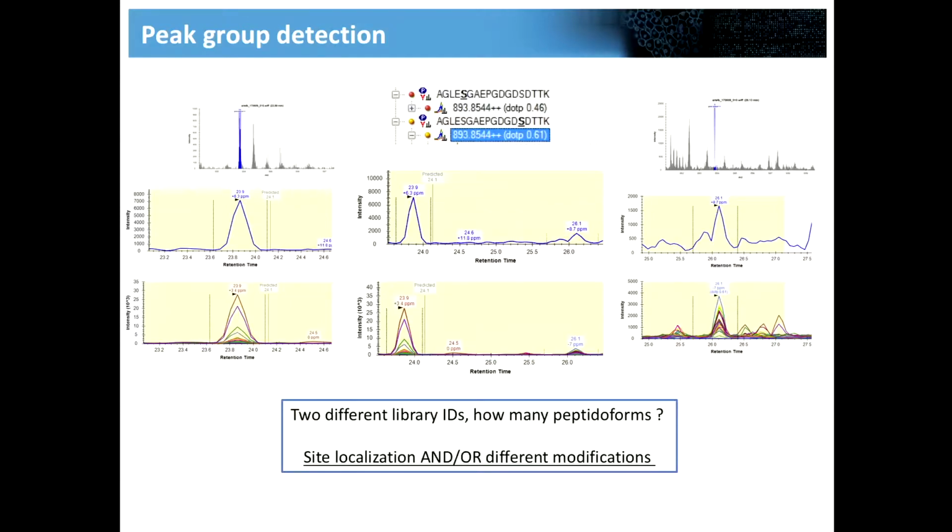I actually don't know. Do you know? This is from the 6600. It might be something to do with the centroiding, right? Because the MS1 is collected at 30,000 resolving power, and the MS2 is collected at 15,000 resolving power. So maybe the centroid is behaving differently on those, or the extraction windows are different widths or something. Is it centroided data? No, it looks like profile. This is profile. But anyway, it's something to look at, I guess. I almost always see this, I will show one example where it's not the case, but I actually don't know the answer to that.